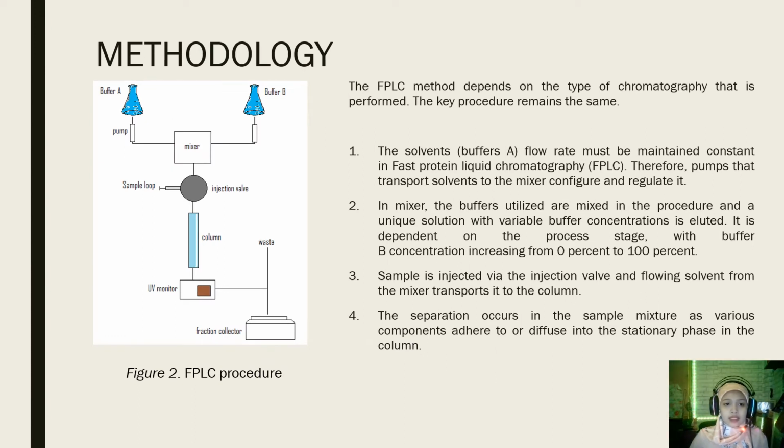Next, I will explain the methodology part. So, the fast protein liquid chromatography (FPLC) method depends on the type of chromatography that is performed. The key procedure will remain the same even though the type of chromatography is different.